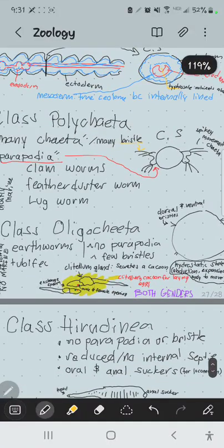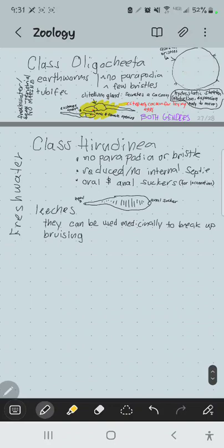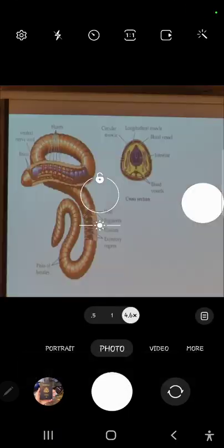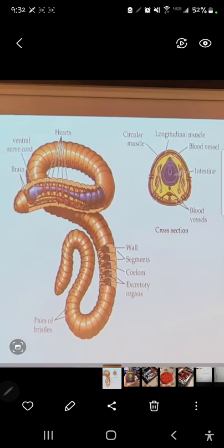Okay, so let's take a look at our dissection here. I'll euthanize these worms in alcohol. It'll take a few minutes to do that. The easiest way to do this dissection is with these metal pans here. Grab a pan with wax on it, and then we have these super fine point scissors. Make sure that when you get scissors, you don't get the big blunt ones. Get the ones with really, really fine points, and those are the easiest to use for the dissection.